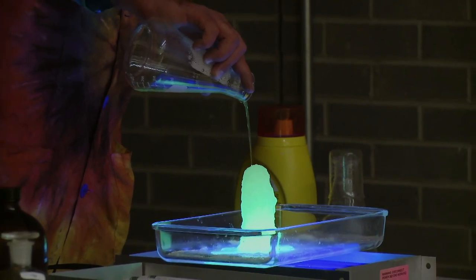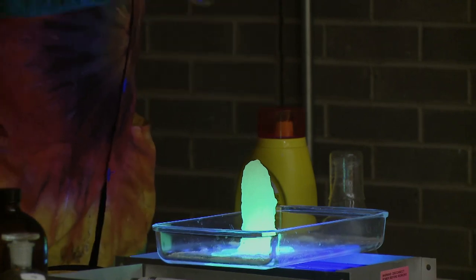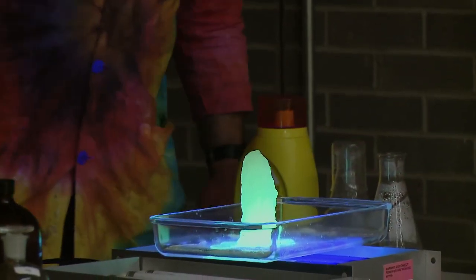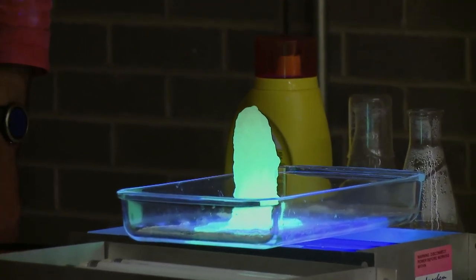Now I'm going to pour this out — there's some sodium acetate on the bottom — and you can see it instantly crystallizes as I pour it. We can make a great big tower of sodium acetate. I'll be able to pick that up, put it back in the flask, heat it back up, and use it again. That's fluorescent sodium acetate — a reversible reaction.